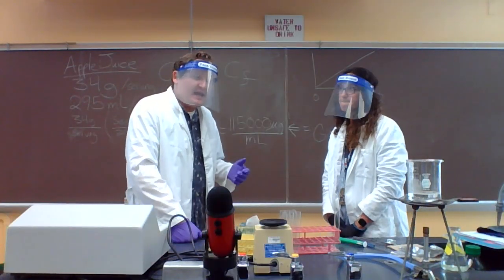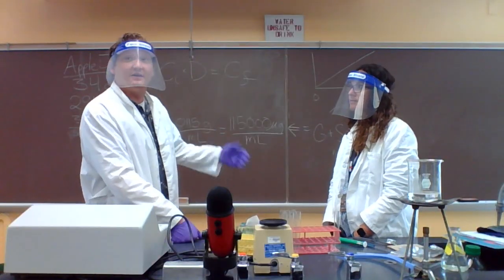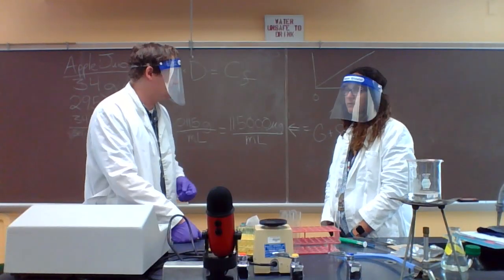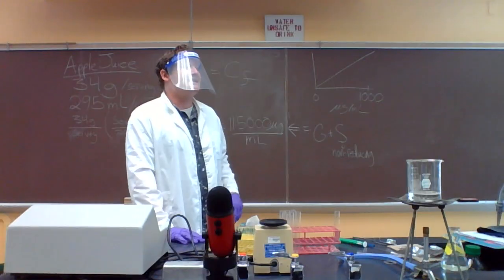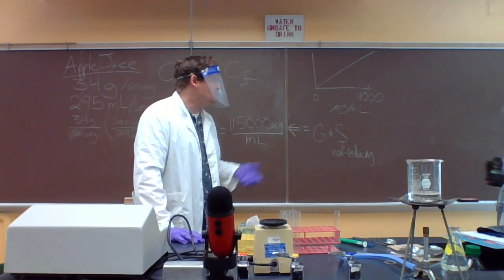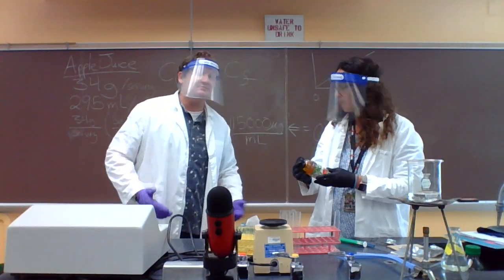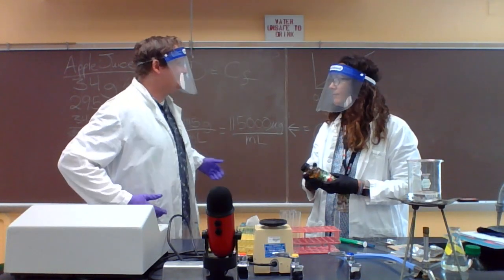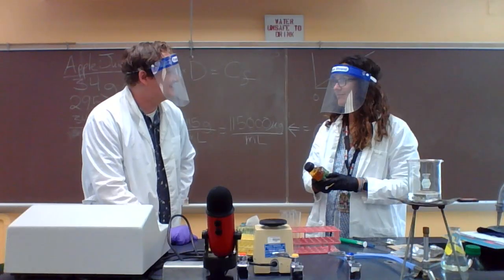We're going to be doing a demo with apple juice, which of all of our options is the highest carbohydrate concentration, our highest sugar concentration beverage. You'll see on Canvas that we have 10 different beverages that you can choose from in order to do your assay. If you were in lab, then we would have these all sitting out and you would just collect them and do the experiment yourself. But instead, we'll be doing 10 different assays determining glucose concentrations there.